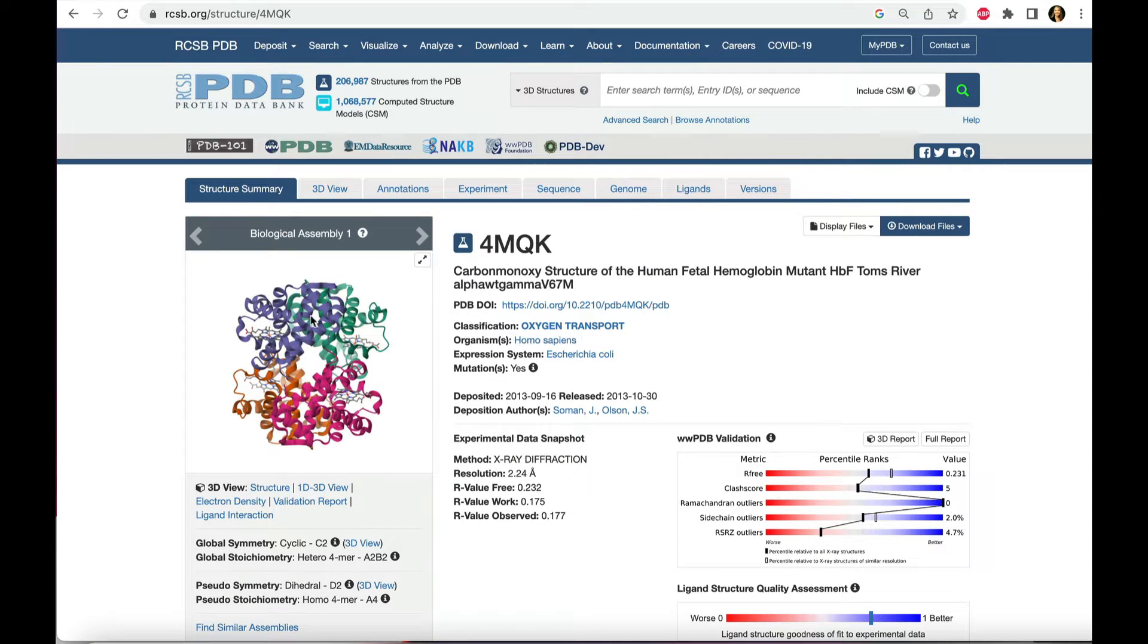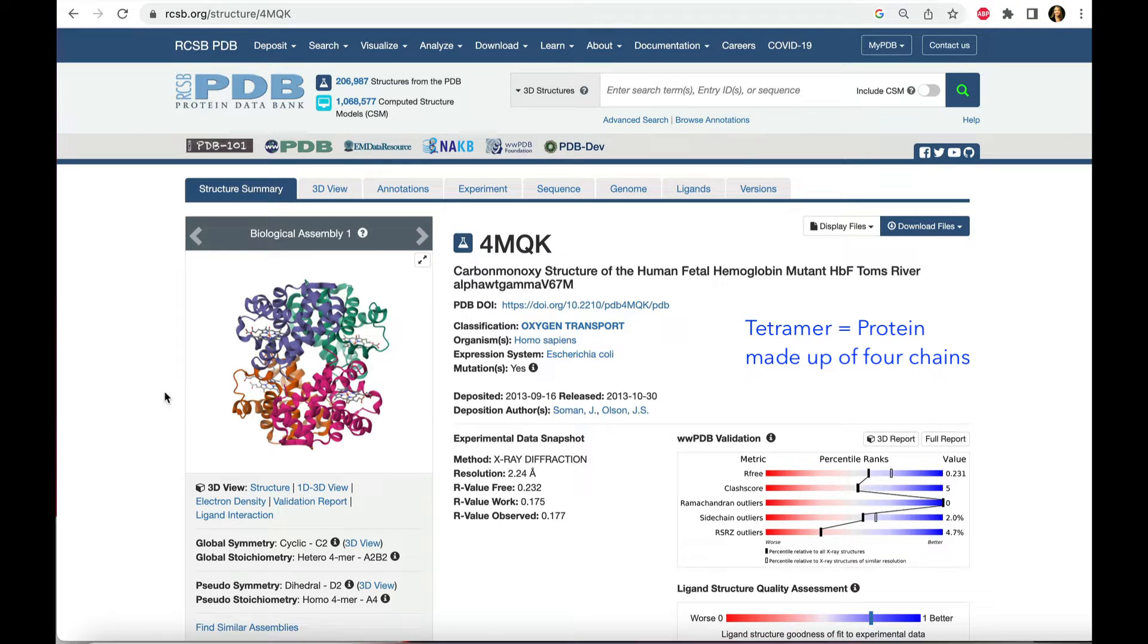On the page that comes up, notice the four differently colored parts. Hemoglobin is a tetramer, a protein made up of four separate chains.